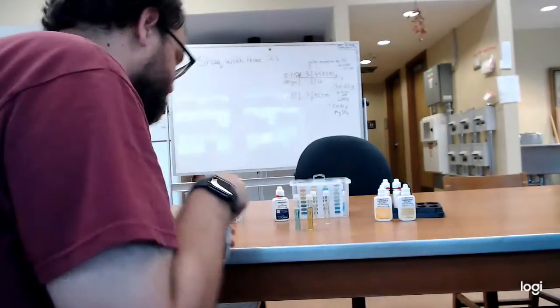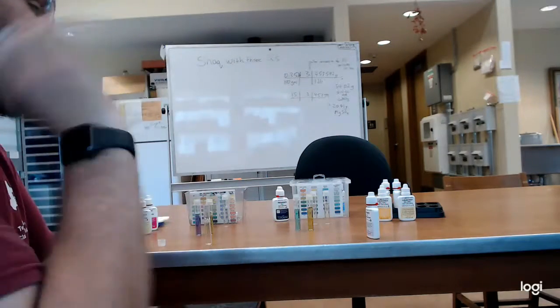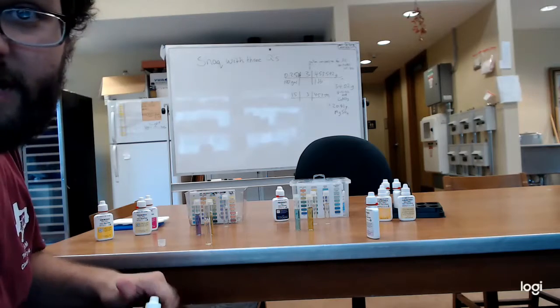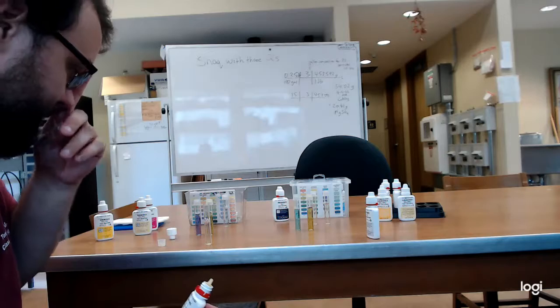Now we will move on to the nitrate. This is actually one of my favorites. This is a very common test. Most of the time you're looking for nitrogen, and the most common nitrogen you're looking for is going to be those nitrates. That is your plant available form.